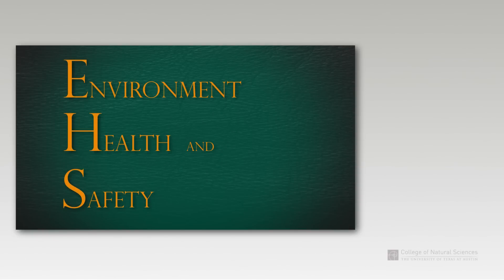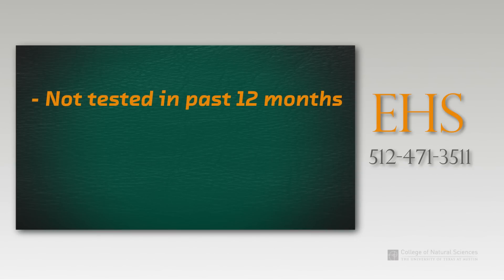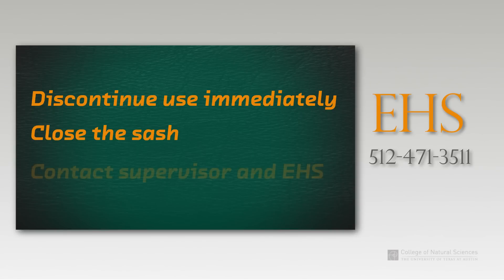EHS is responsible for testing fume hoods on campus annually. If your fume hood has not been tested within the past 12 months, if an alarm has gone off when using the hood, or if you simply suspect that your fume hood is not working properly, discontinue use immediately, close the sash, and contact your supervisor and EHS.